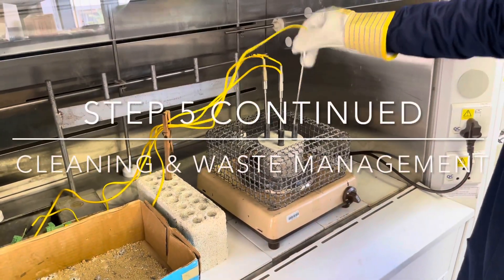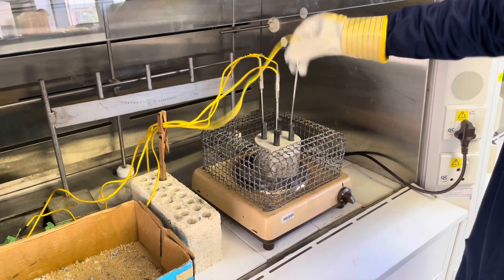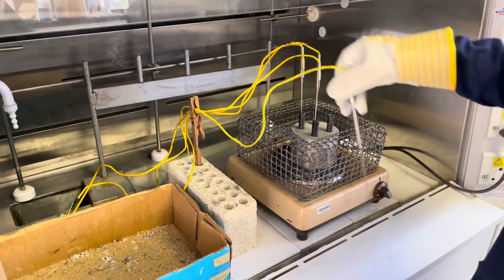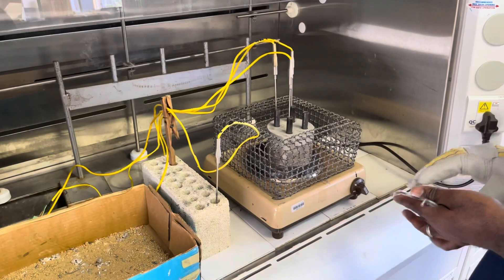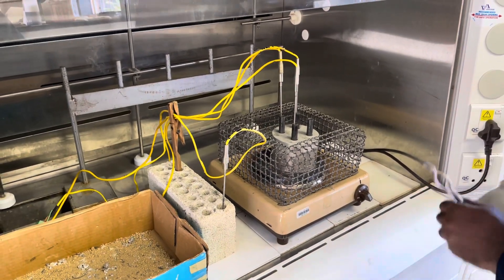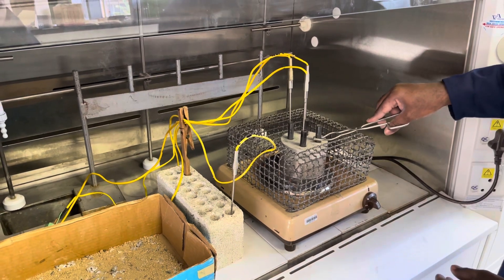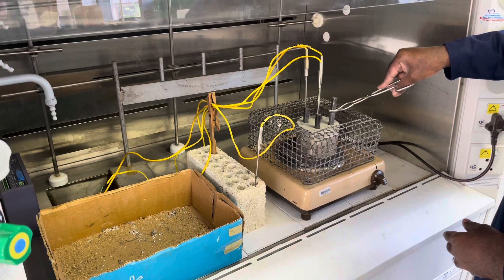Once the alloys have melted, you should be able to easily remove the thermocouples. To clean them, you can gently shake them in the steel test tubes. You can then place them in the cooling rack since they will still be quite hot. You can also dispose of the alloys and pure metals in the sand waste box provided, using the metal tongs.